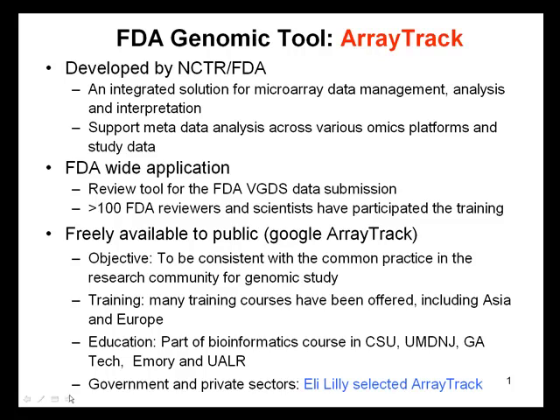So apart from its popularity among the FDA centers, ArrayTrack is also freely available to the public, and it's become very popular in different bioinformatics courses in universities, for example in Colorado State University, Georgia Tech, University of Arkansas, Little Rock, and so forth. We've given training courses all over the world in countries in Asia, Europe, and such. And ArrayTrack has also found its way into the private sector. Recently, pharmaceutical company Eli Lilly, after rigorous due diligence testing, chose ArrayTrack as their primary microarray data management and analysis tool.